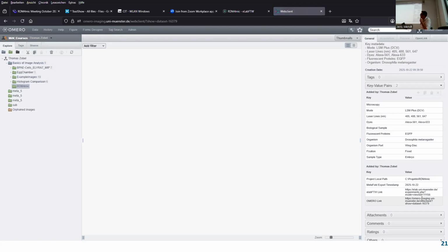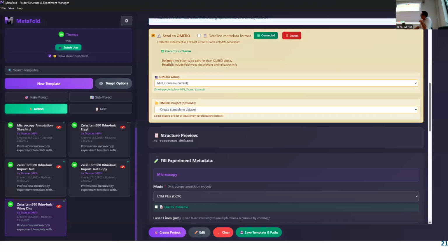And we are using it. Jens wrote a script so that we now also have the local folder where we have a JSON file and an HTML README with the links to the dataset ID. So this is next to the data. Students do this at the microscope, creating the folder and saving their data into the folder. This is anyway in the cloud, and we are automatically uploading the files from the microscope to the dataset ID in OMERO.